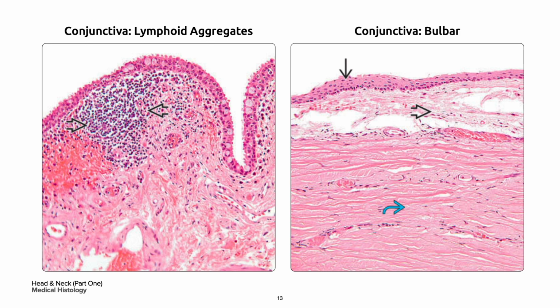On your right is a portion of the conjunctiva overlying the sclera in the curved blue arrow, which is known as the bulbar conjunctiva in the single black arrow. The bulbar conjunctival stroma is composed of loose connective tissue in the bold black arrow.